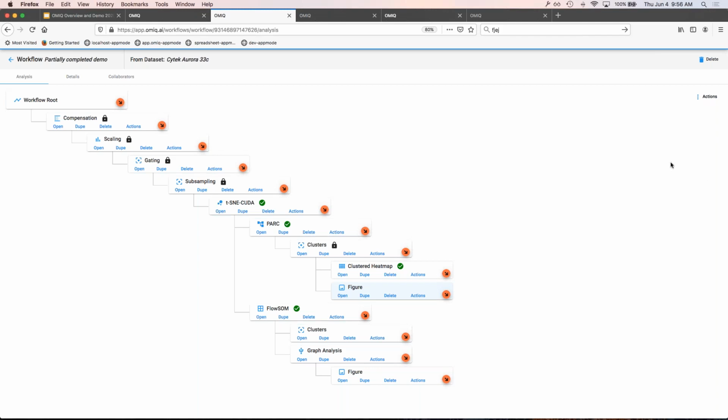Okay. For the t-SNE CUDA that you showed, what makes it so much faster? The reason that it's so much faster is because the instruction set for the algorithm has been mapped to process on GPU, right? So GPUs are graphics processing units. It's a special form of computer hardware that's used for rendering graphics, but you can also take advantage of them for other types of machine learning that does a lot of computations at once. So there's a lot of literature on the internet about this. So for further discussion, I'd put it there. There's also a paper for t-SNE CUDA. It's an algorithm that came out of Berkeley, I think a year or so ago. Definitely a good read, so check that out.